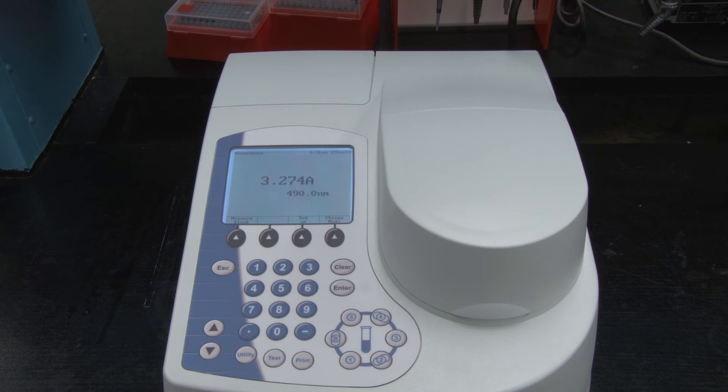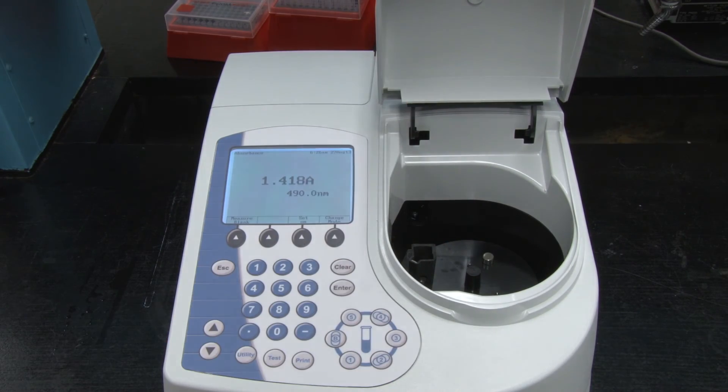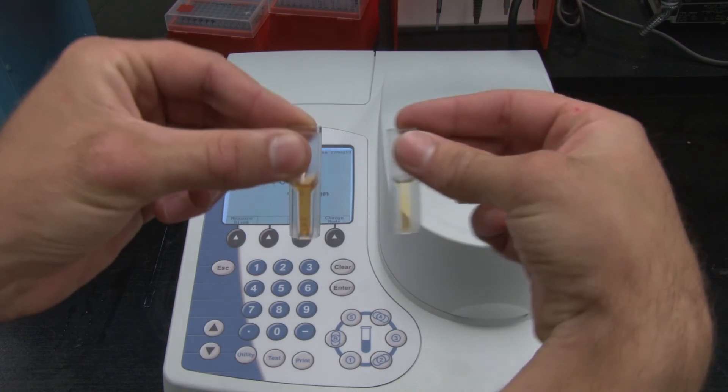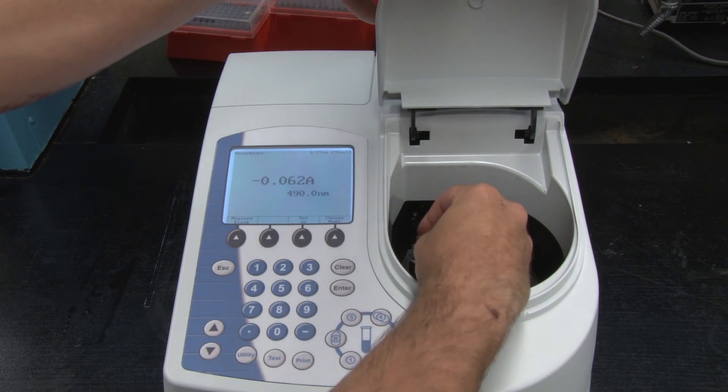If the spectrophotometer reads outside the range, you must make a dilution to ensure accurate readings. Read your diluted sample in the same way and account for the dilution in your calculations.